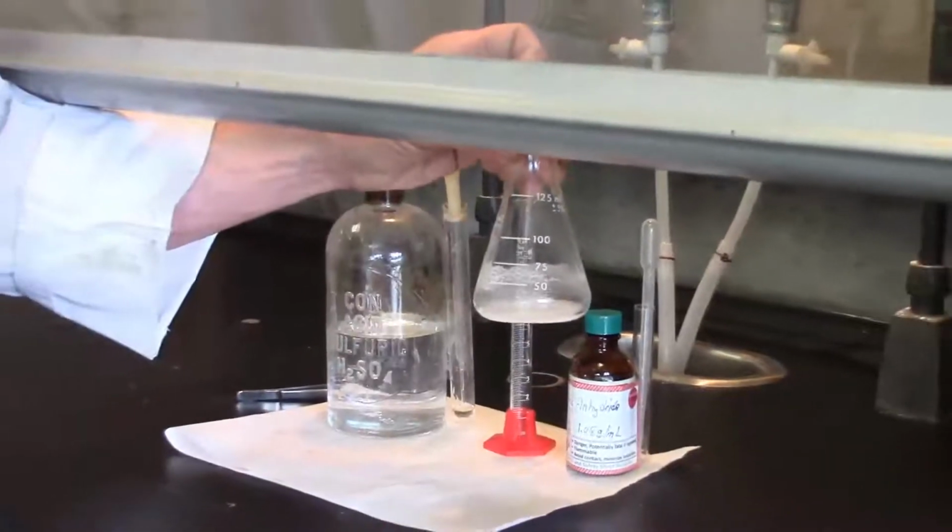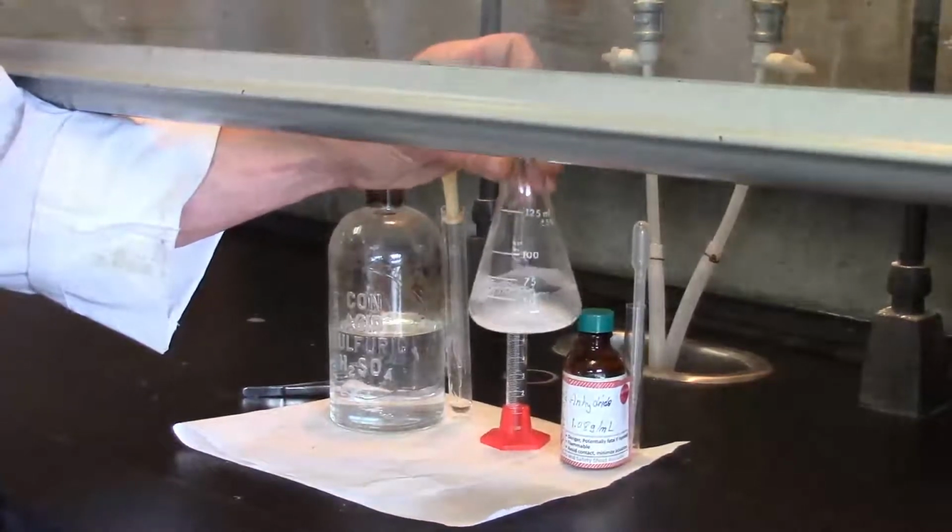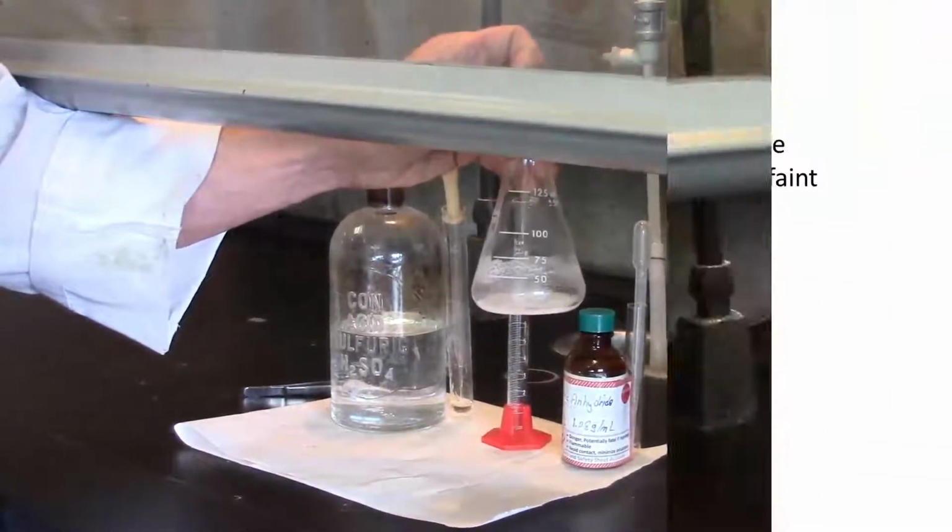So now let's go back to the bench where we have our hot water bath ready to progress with the rest of this reaction.